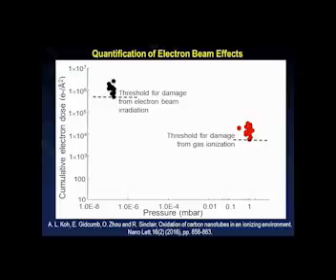And then also for gas experiments, it could be something as fundamental as what sort of TEM grids I should be using. So let's say you're going to do a hydrogen experiment, I would never encourage anyone to use any TEM grids with carbon support film at all, because the carbon might react with the hydrogen and form hydrocarbons, for example, during the experiment. So it's not more a mistake per se, but experimental planning becomes ever more important for in-situ experiments to do the proper and the actual experiments.